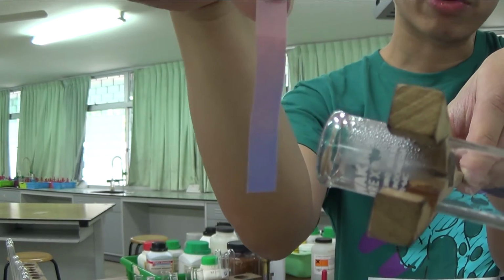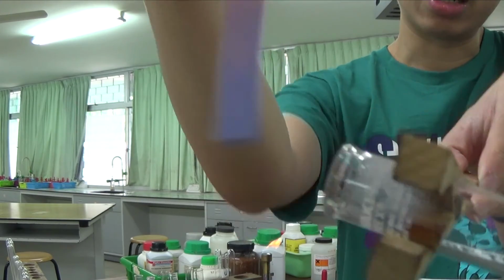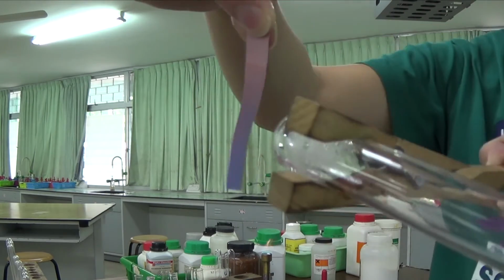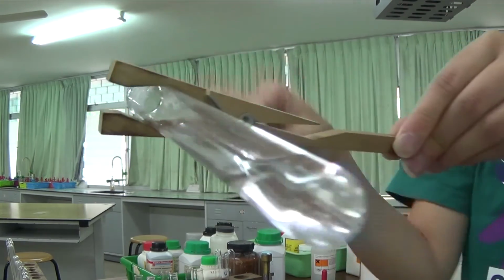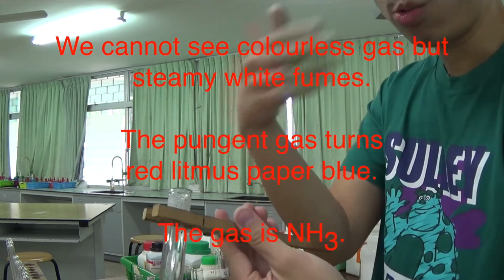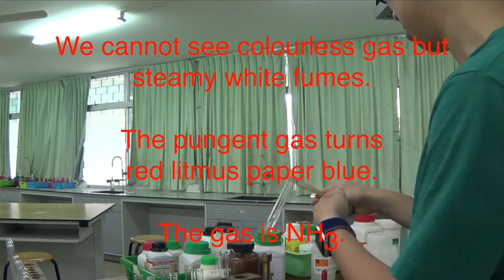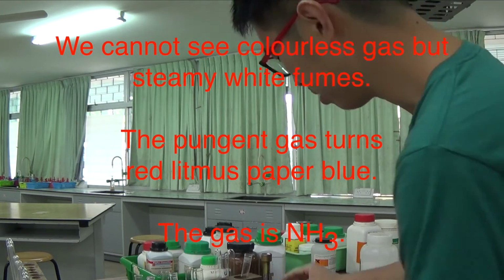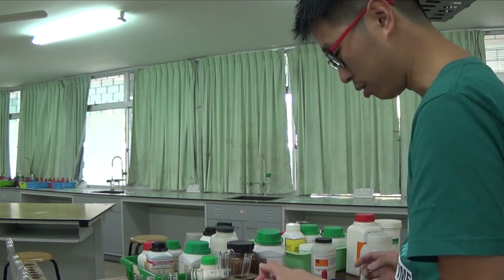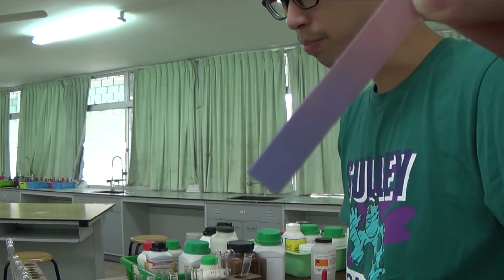So my moist red litmus paper has turned blue. By heating the solution, and of course you can whiff it as well. It is ammonia, right? It smells like a lot of urine accumulated in the toilet. So my red litmus paper has turned blue.